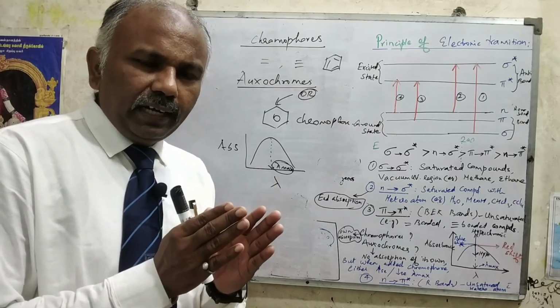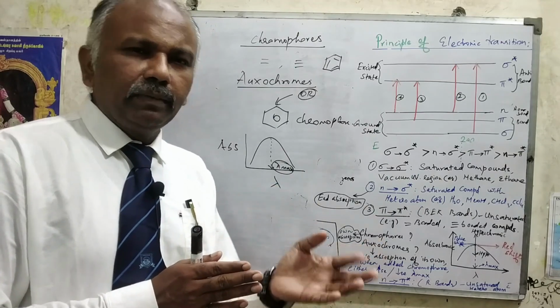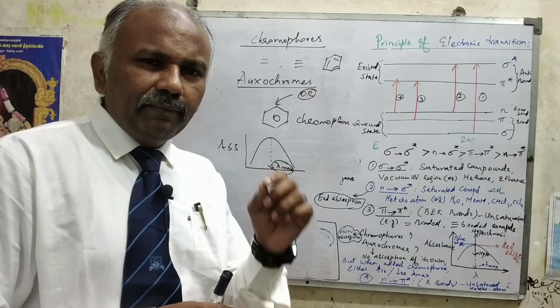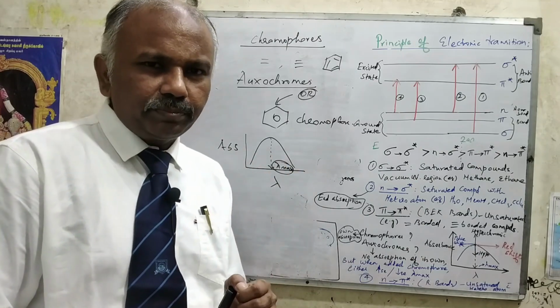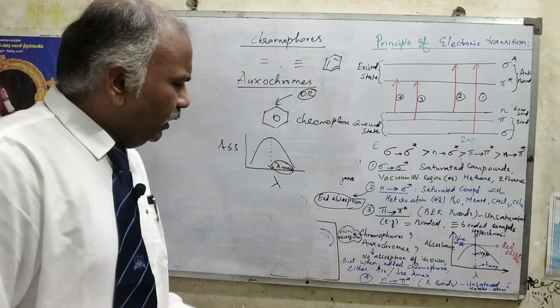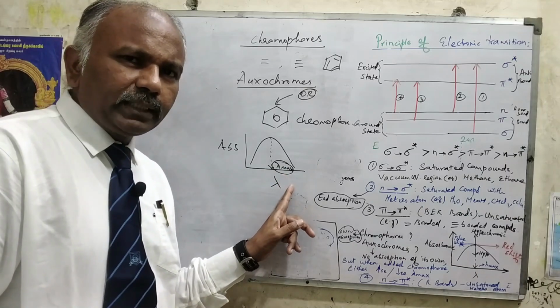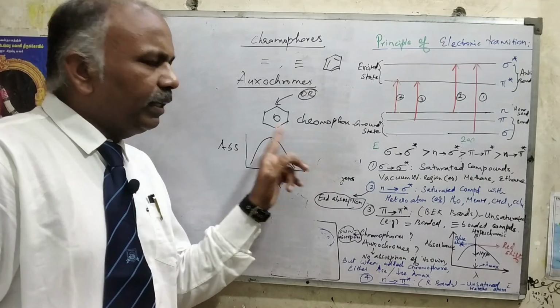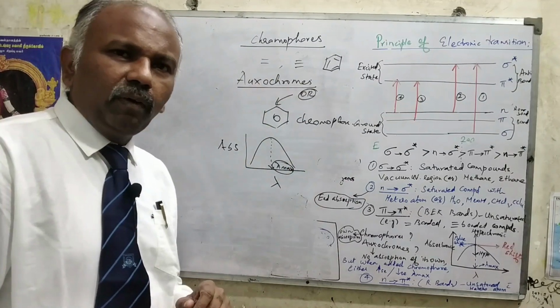So how are we classifying, depending upon whether it is aspirin or paracetamol, how will you classify the drug molecule? Every drug molecule has its unique lambda max value based upon the solvent, right? So this lambda max is a qualitative aspect, an identification aspect, and once we know this lambda max, it is very important to see the various definitions of auxochromes.